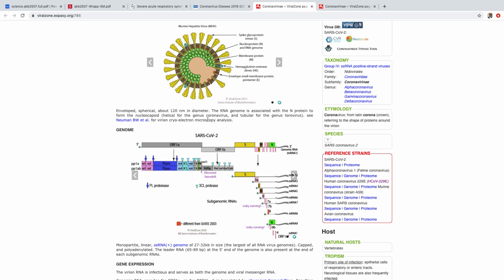So this is also a good illustration of the difference, indicated here in red. Right near the nucleocapsid gene, there's a sequence which is different in the novel coronavirus from the SARS 2003 virus. So now that we know where we should design the primer, we can go ahead and design.